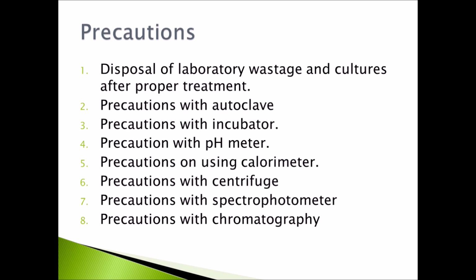Then, precautions with centrifuge. It is a piece of equipment that puts an object in rotation around a fixed axis, applying a force perpendicular to the axis of spin that can be very strong. And it is used for separation of fluids, gas or liquid based on density, and separation is achieved by spinning a vessel.